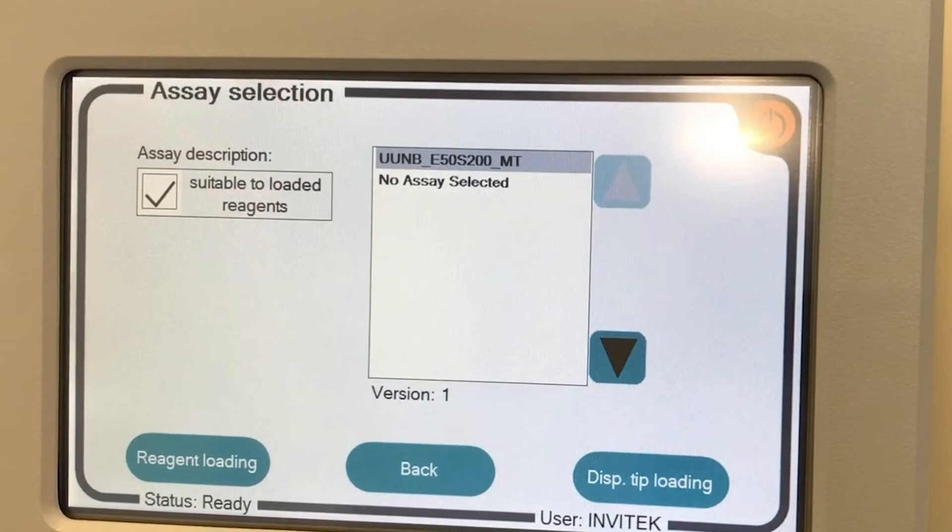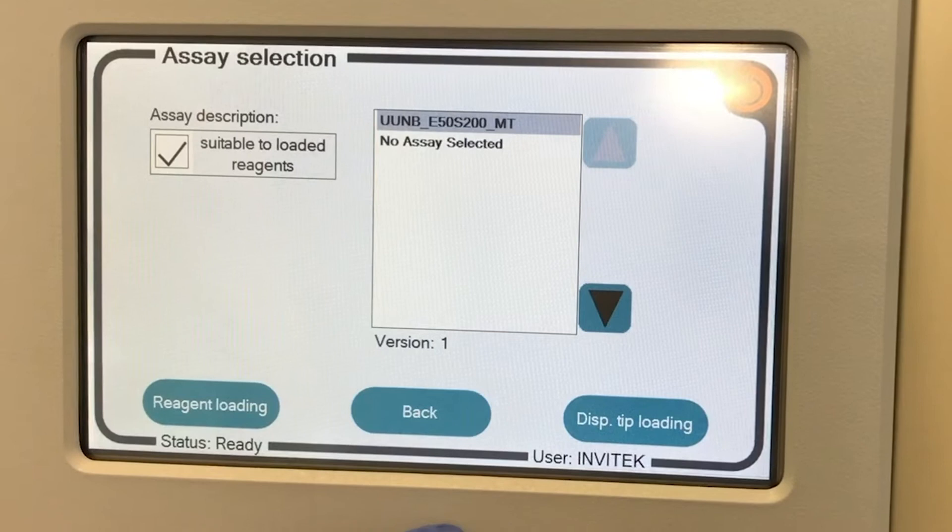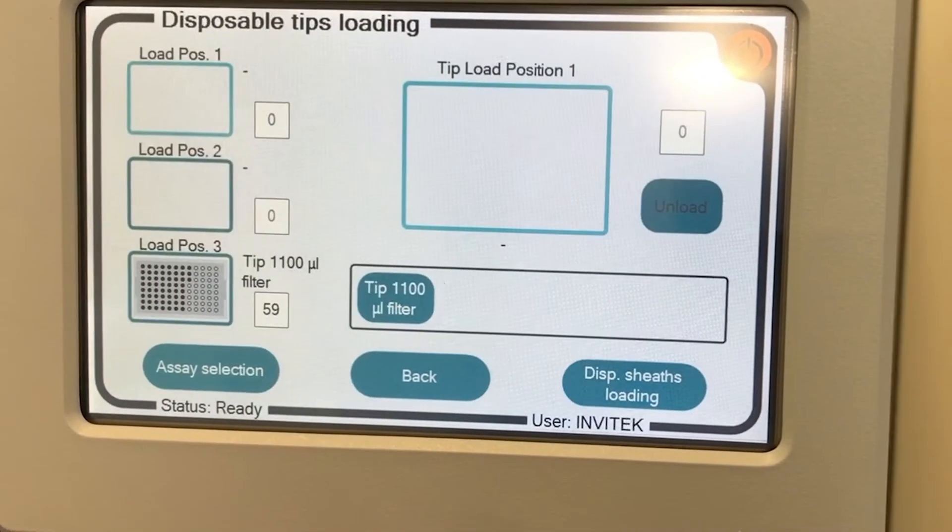Select an assay and continue with loading consumables. The step-by-step wizard will guide you to load consumables.